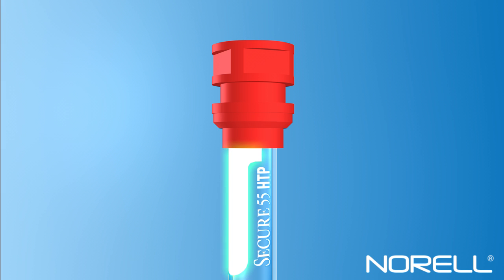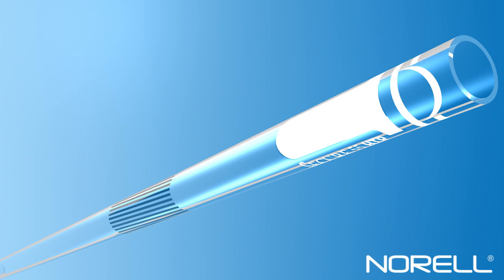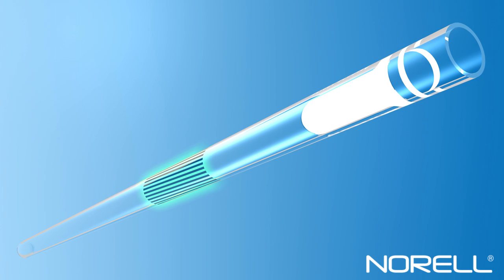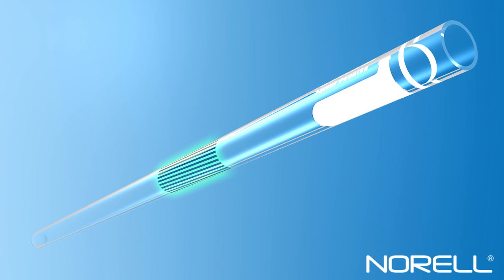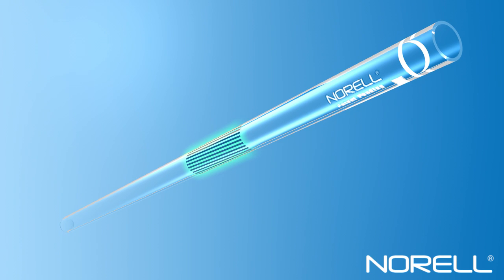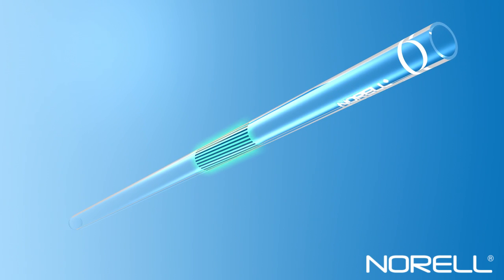In addition to its other innovative features, the Secure Series NMR sample tube uses a patent-pending surface treatment with a unique textured surface that ensures precise and positive retention in Bruker or Agilent Varian Spinner turbines.